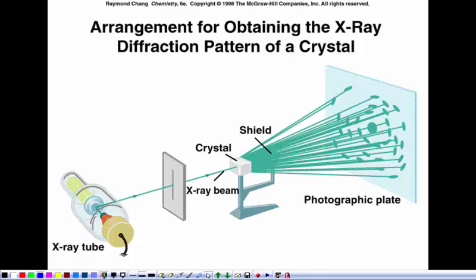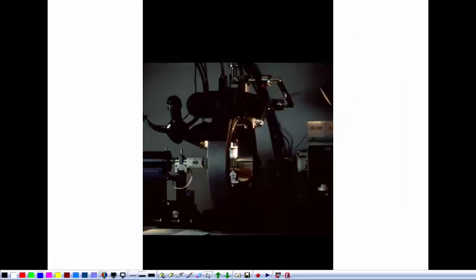We have what's called a powder diffraction instrument, but places like Case and Youngstown State have a couple of these instruments, and so sometimes I'll send crystals down there to have their structures done. I did this for 2 years as a postdoc, nearly 20 years ago when I was at Brown. And basically what happens is that you take the crystal, no more than a millimeter wide for a normal organic molecule, and you put it on the end of a glass fiber.